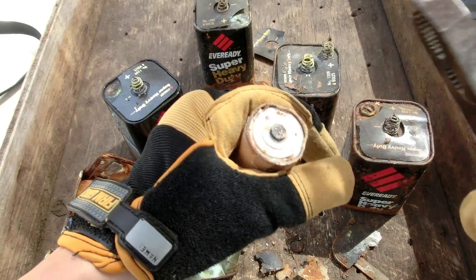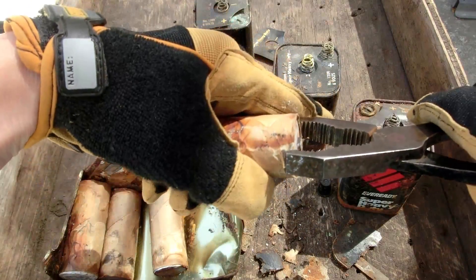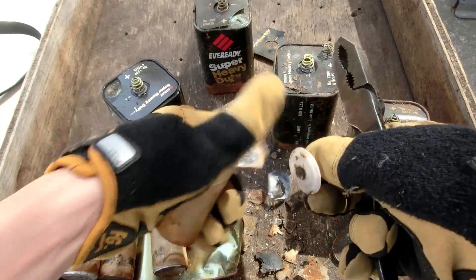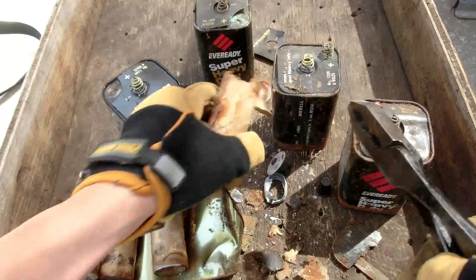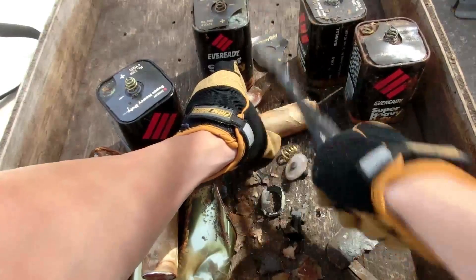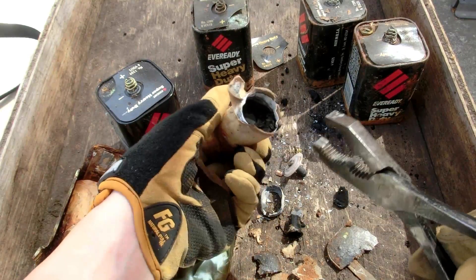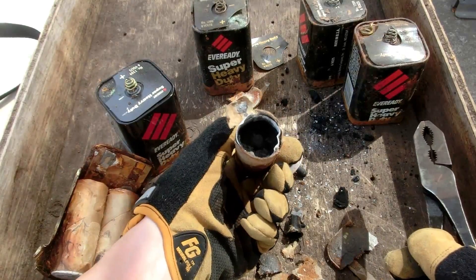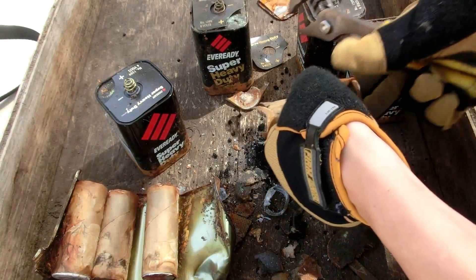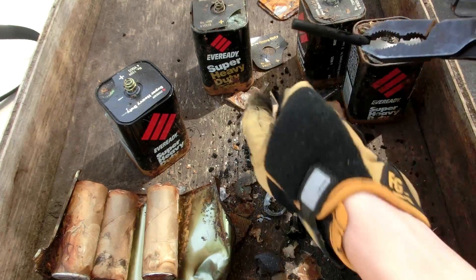That might be the graphite rod right there. Well, at least they have a graphite rod. That's pretty hard in there. I may save this because I believe this is manganese dioxide — can't remember for sure. And there we go, we have graphite.